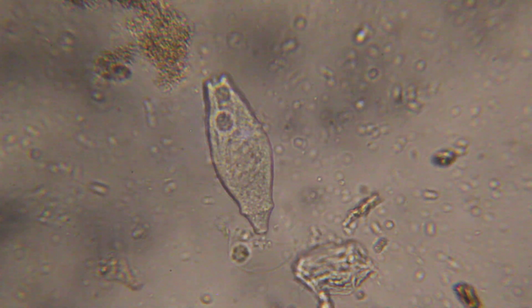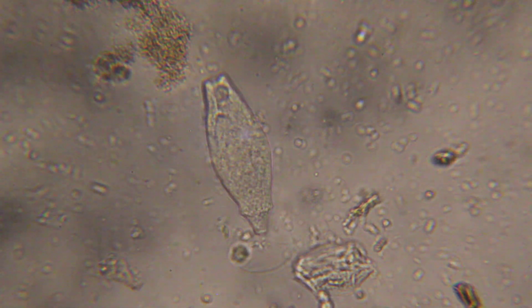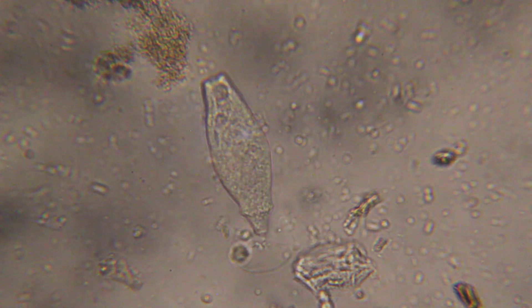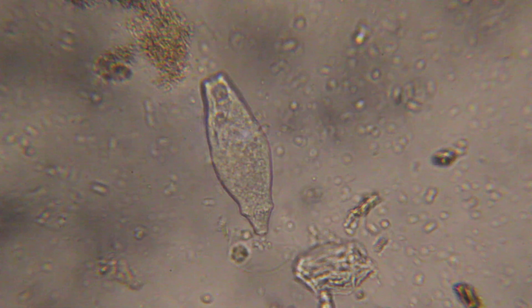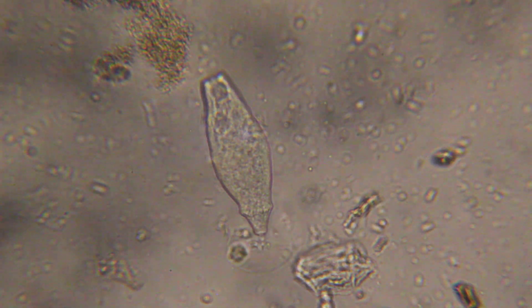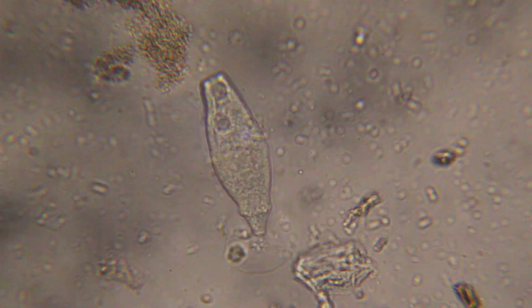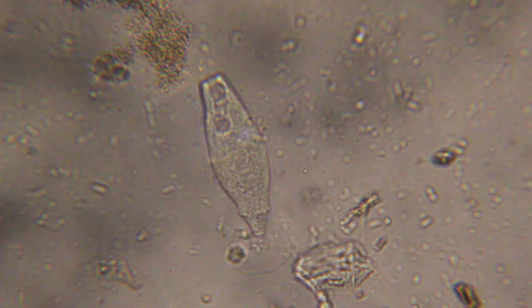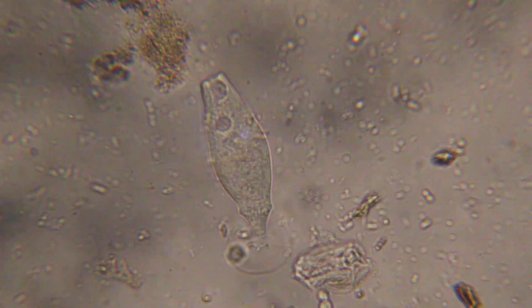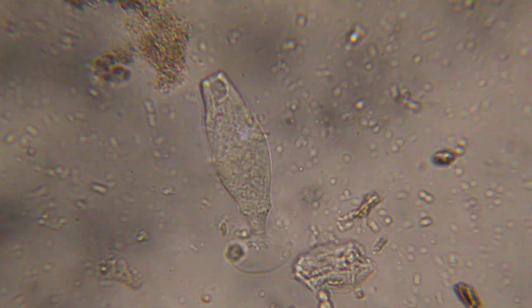This is a shot of a microbe after I took a sample of frozen water out of my backyard. It's about 25 degrees here right now, and I took about a quarter of a teaspoon of frozen water, put it in a vial, and mixed it in with some filtered water from the sink. Let it sit for a while, and lo and behold, everything is doing just fine in there.